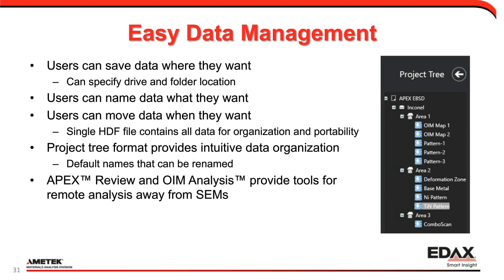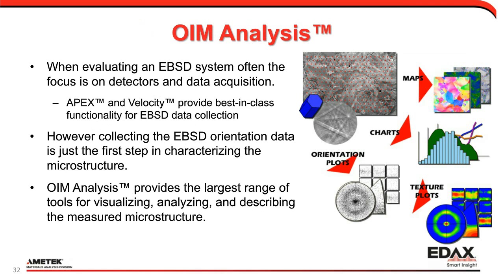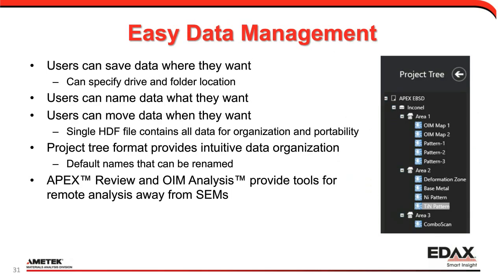And of course, I'm going to talk now about OIM Analysis. This is the review tool that we use to process the EBSD data. Oh, clicked one too early there. Sorry, that's the one I want.